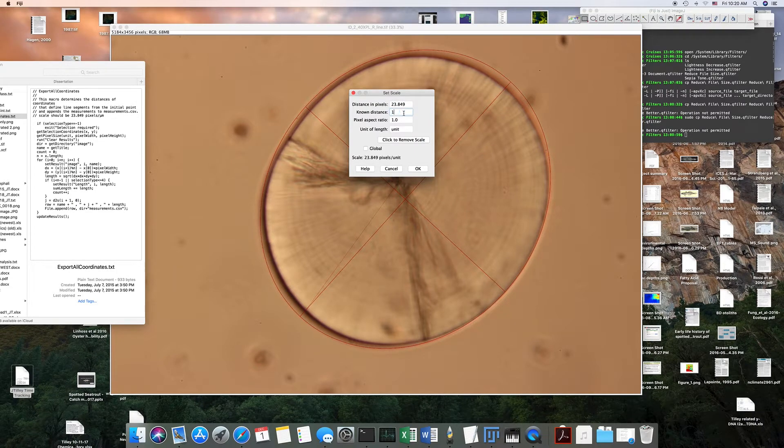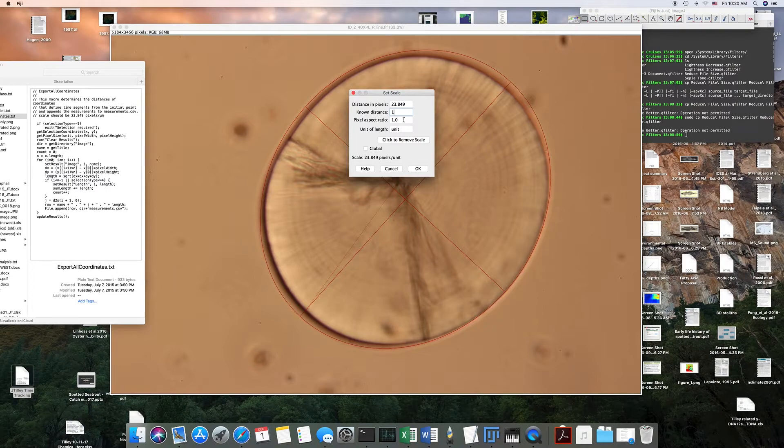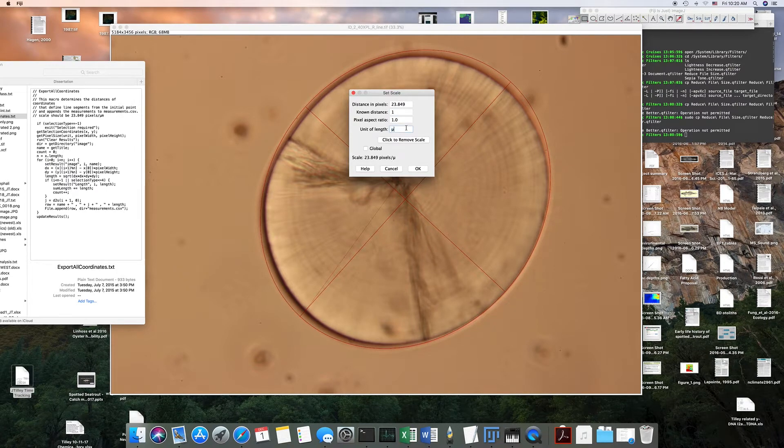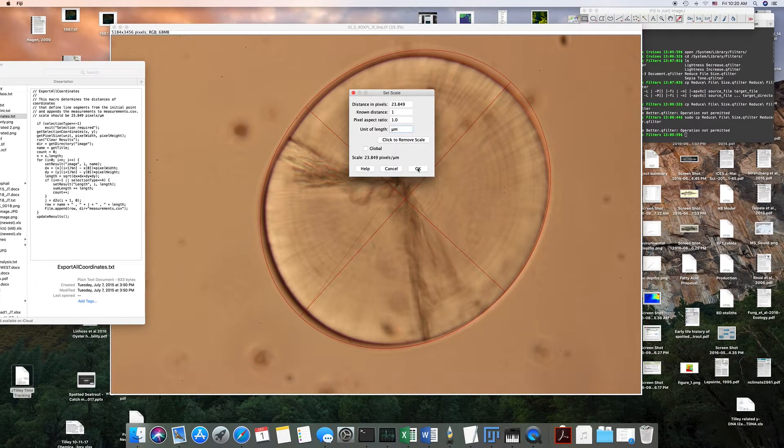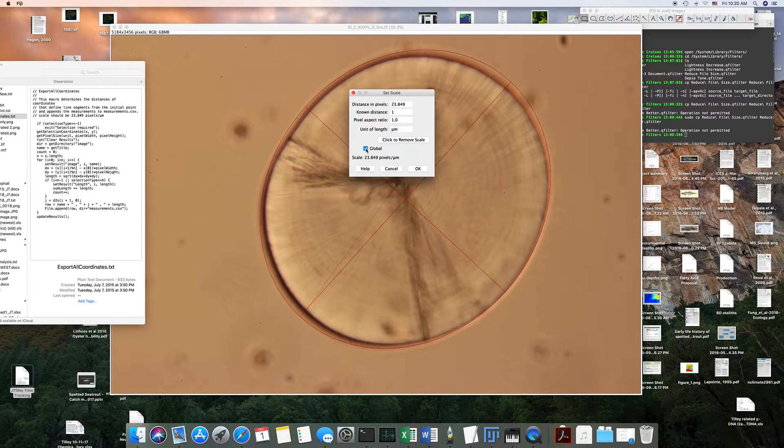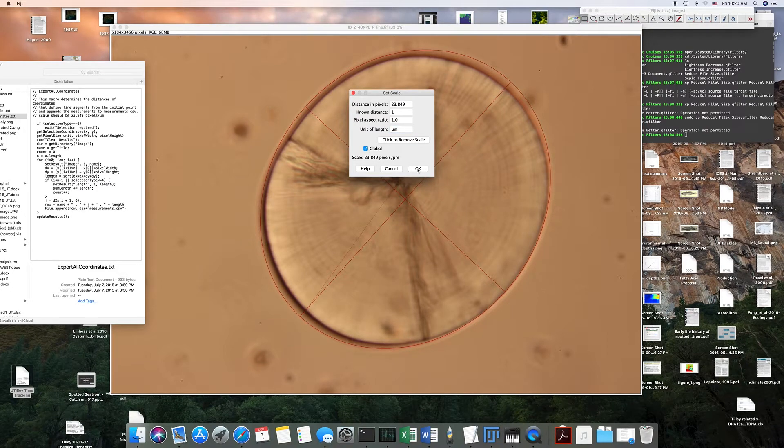...was equal to one, and the unit I'm going to use is microns. That doesn't really matter what you put here, and I believe you might want to put global.